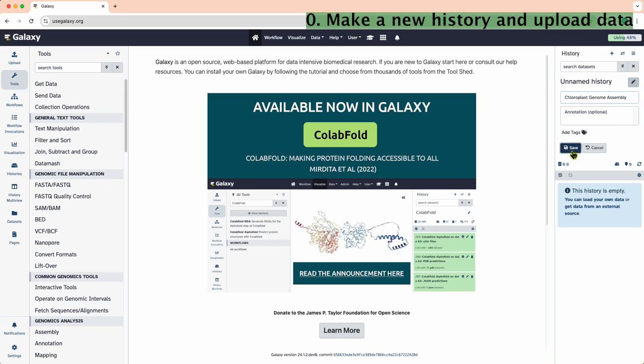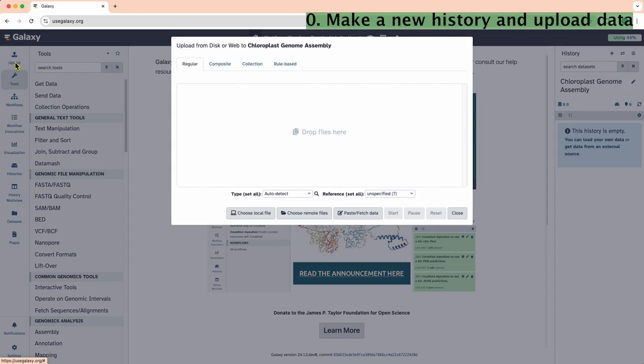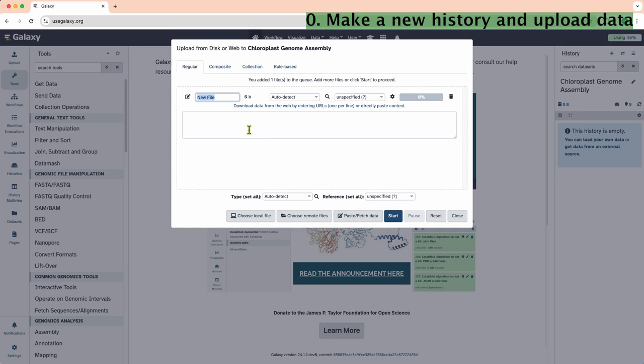First, name a new history on Galaxy. Next, go to the Upload tab. Copy the Genodo links for reduced sweet potato data files. Paste them, name the files, and click Start.